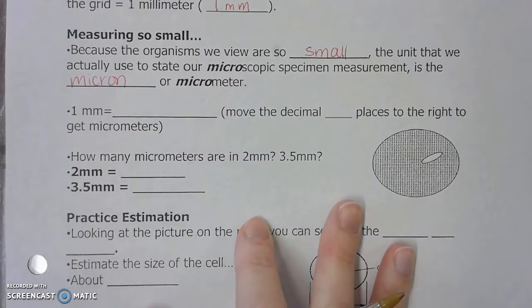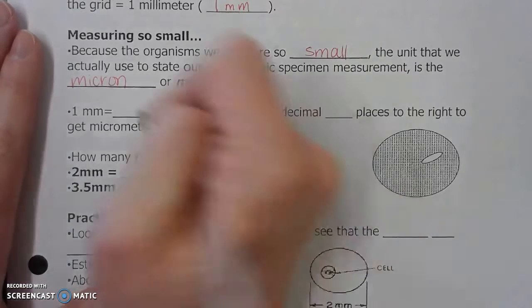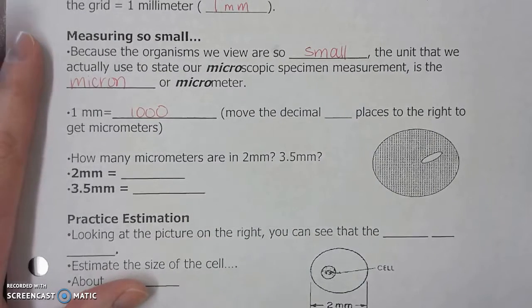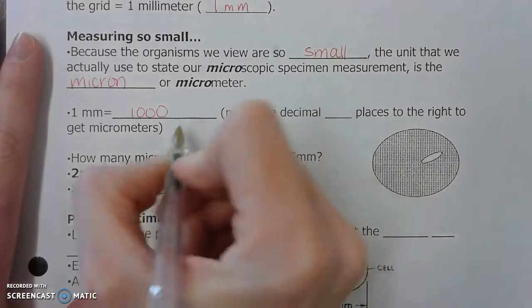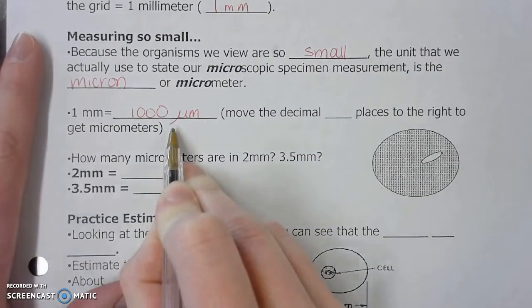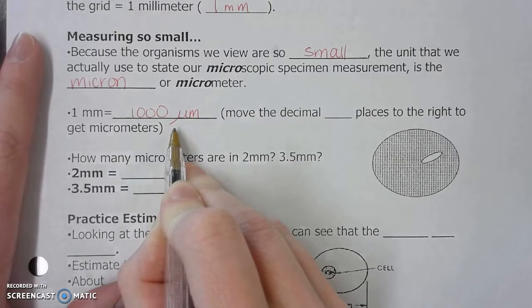So in comparison, 1 millimeter equals 1,000 microns or micrometers. The symbol for micron looks like a U and then an M, but the U has this little front tail.